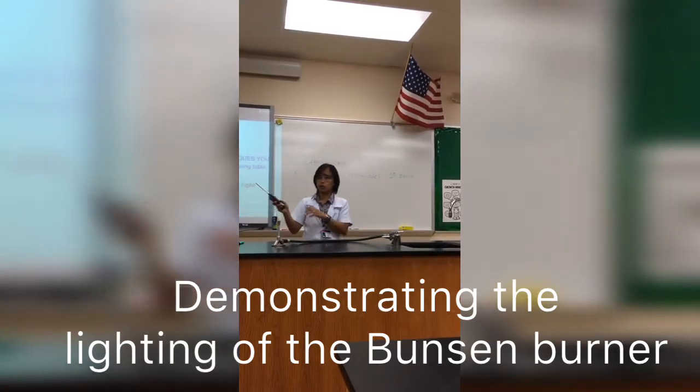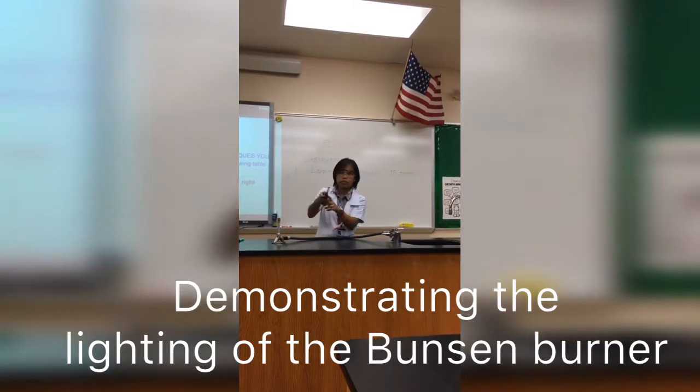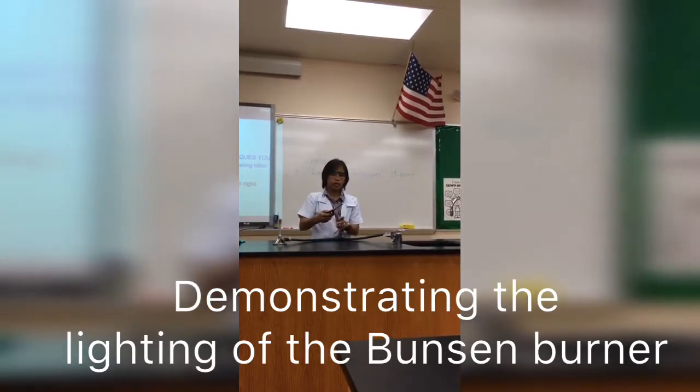So now we're ready. This is the match we're going to use. You just need to slide this, press it, click it, and then you're going to get the flame.